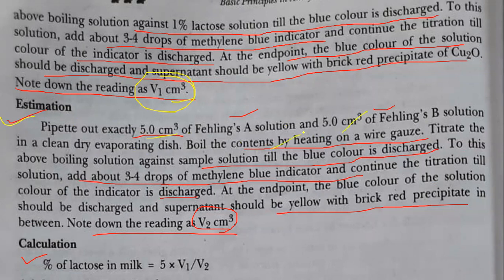Boil the content on a wire gauze. Then titrate the boiling solution against the sample solution till the blue color is discharged. Add 3 to 4 drops of methylene blue indicator. Continue the titration till the blue color is discharged.